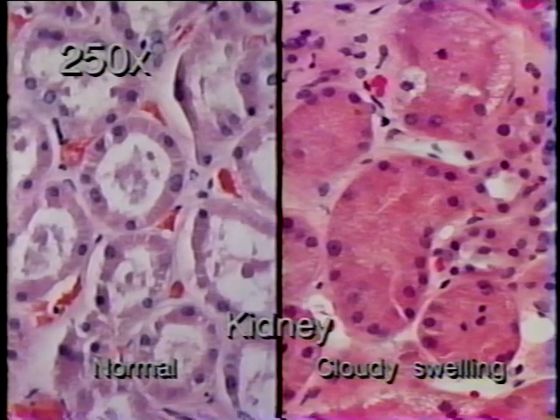This slide shows on the left the normal epithelial cells that form a part of the proximal convoluted tubule. Note the normal pink-stained cytoplasm and the blue nucleus. On the right are cells from a kidney that have been injured by hypoxia. The structure at the tip of the pointer is a section of a proximal tubule. The epithelial cells are so swollen that the tubular lumen is obliterated.